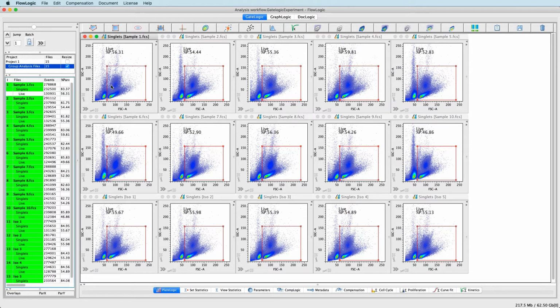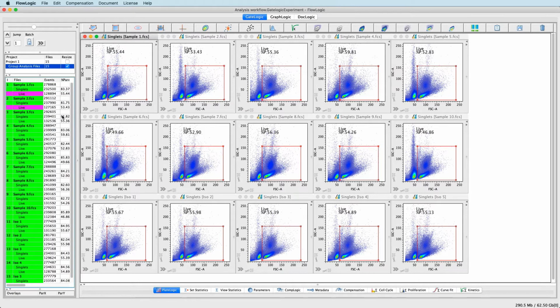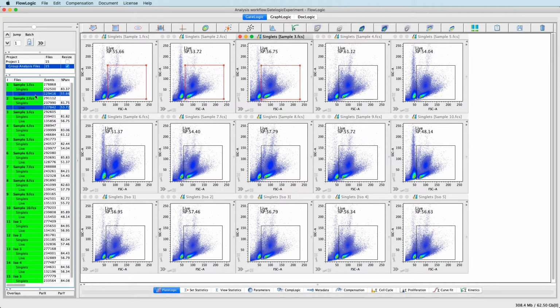And you can see this first rectangle gate can now be moved independently. Additional groups can also be created for a selection of gates, as you can see here. And groups can exist across experiment and project folders. And finally, selected gates can be added back to an existing group.